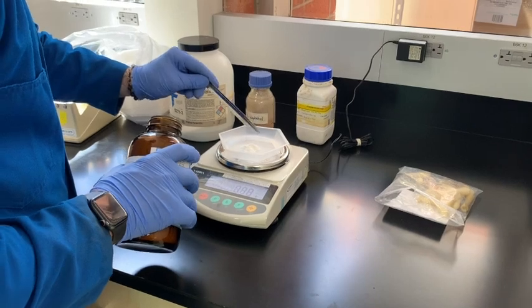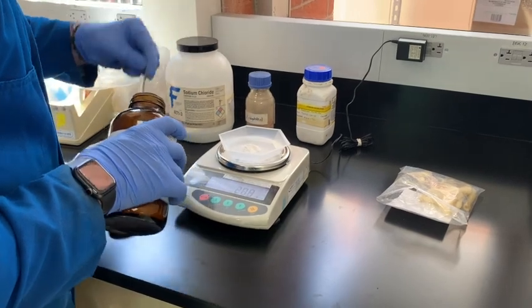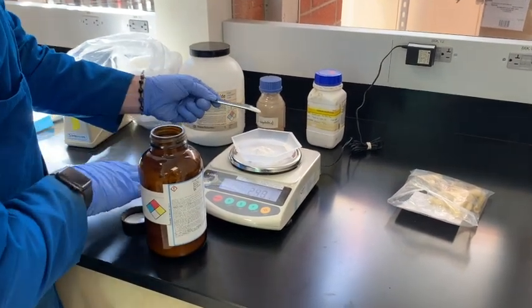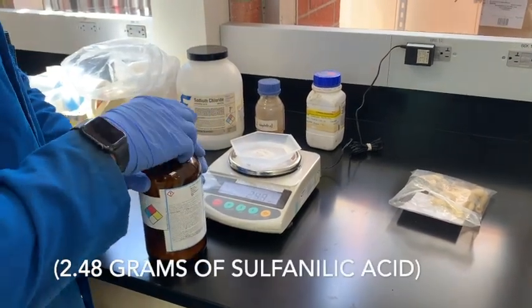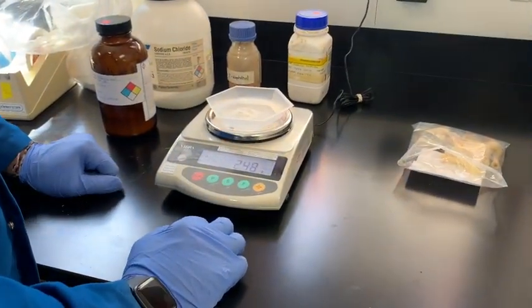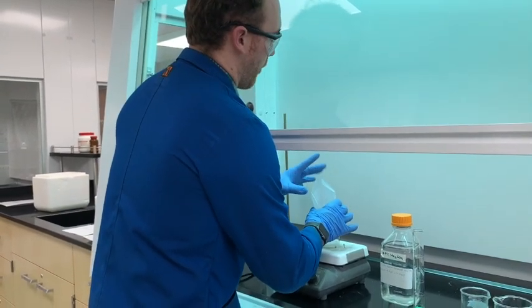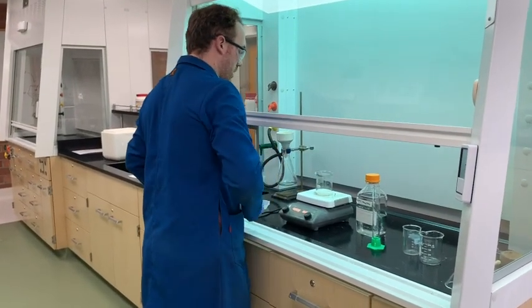A little slower. So we're going for 2.4 grams, getting pretty close. Oh, cool. So we have a little bit more than 2.4 grams. So just make note of that in your lab notebook. In case this was, let's say, the limiting reagent, you want to make sure that you adjust your theoretical yield. So 2.48 grams. Carefully. Don't want to lose any of it, causing further deviations. You want to get that all dissolved.